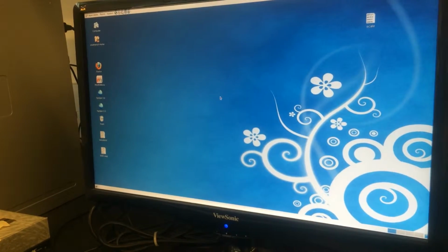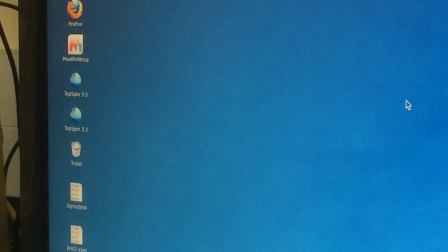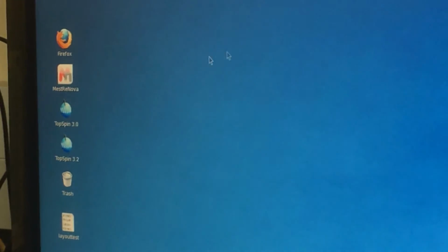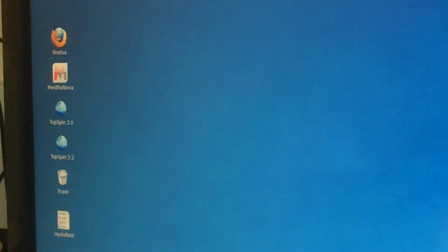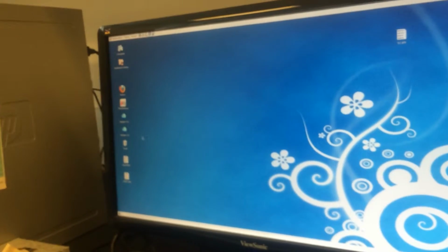Okay, so to process publication quality NMR, you have to use the Topspin software, and on the Topspin computer, that is the second computer in the lab in the NMR room, you have two kinds of Topspin versions, 3.0 and 3.2. You would always want to use the 3.0. Somehow the 3.2 does not work for processing, for making good stack plots.